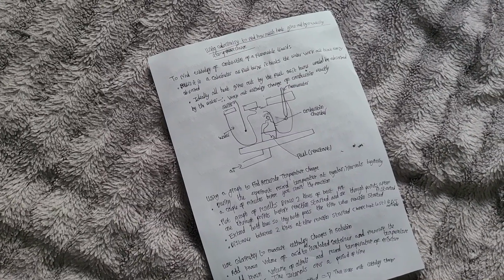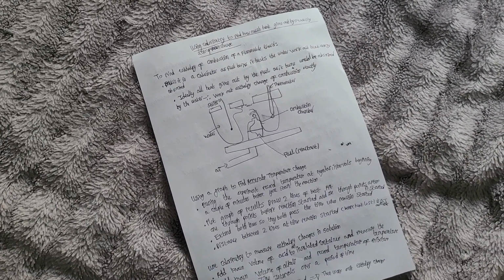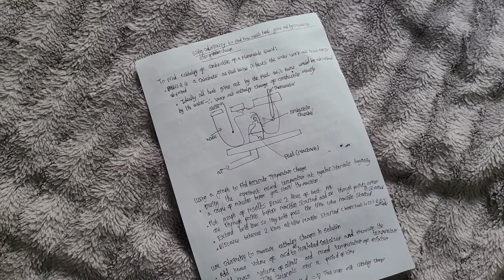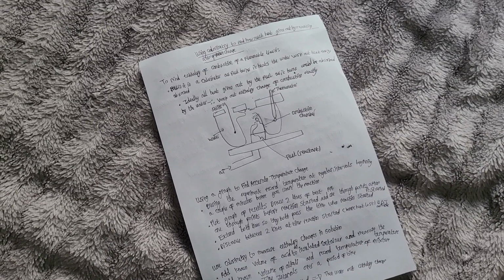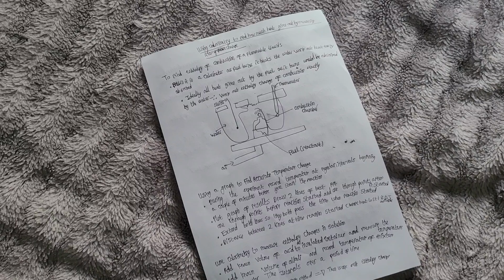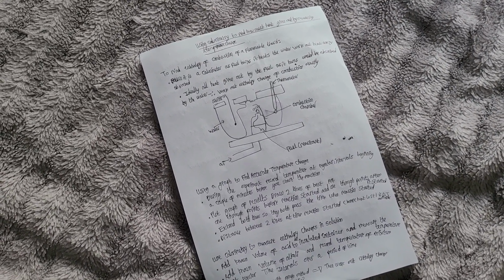Now we need to use a graph to find an accurate temperature change. During the experiment, record the temperature at regular intervals, beginning a couple of minutes before you start the reaction. Plot a graph of the results, and then we want to draw two lines of best fit.